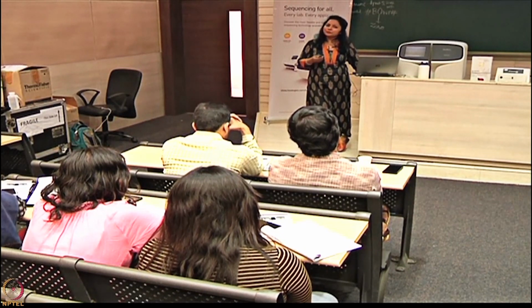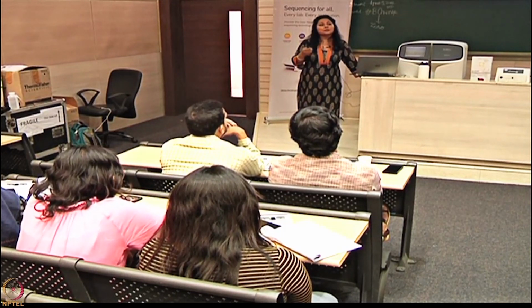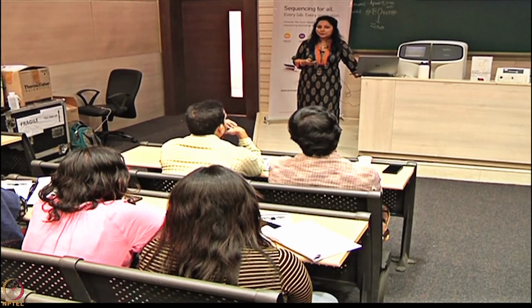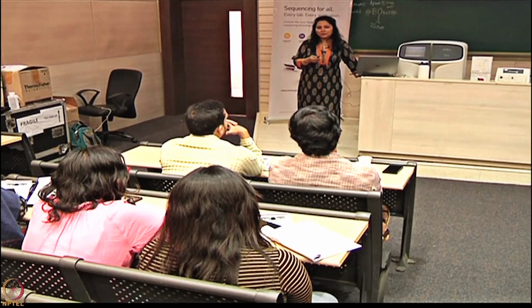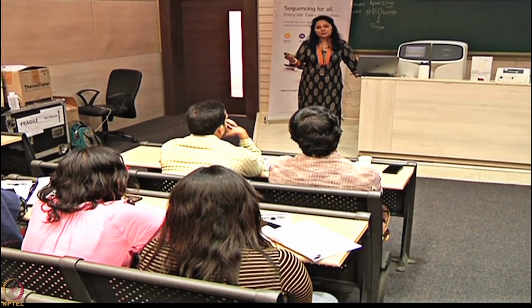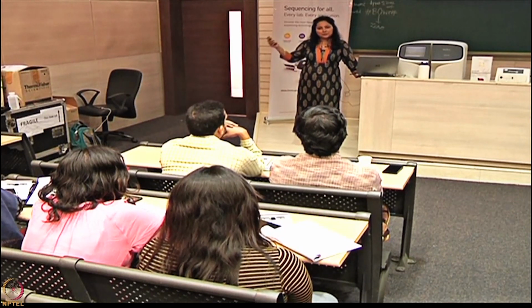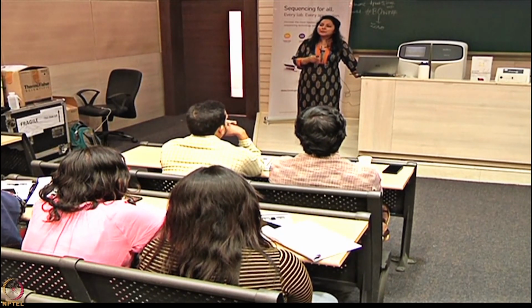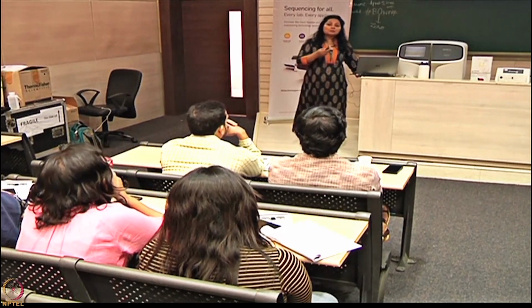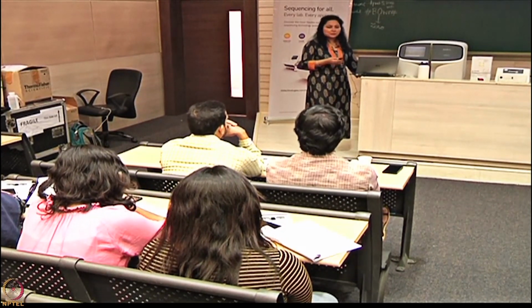So people do a lot of different kinds of experiments. Now what you would look out for in your NGS is that the data requirement for all these experiments is very different. So when you are doing a genome, it's a very straightforward calculation that you generally tend to generate 100x data. So whatever is the genome size, you multiply by 100. There are definitely ifs and buts around it. We'll not go into those details. But the data requirements for these different kinds of experiments are very different. That is where you need that flexibility, that a single NGS system can cater to all those requirements.